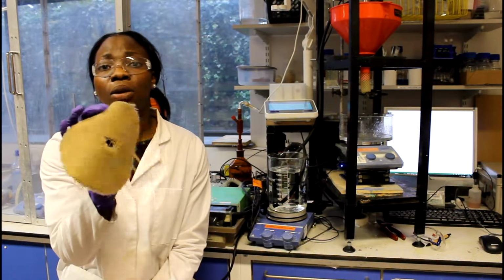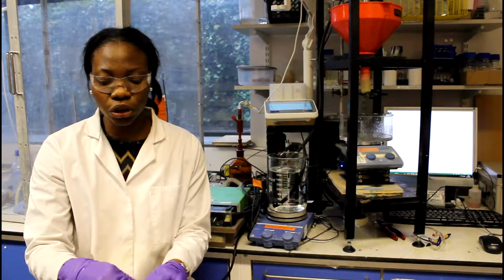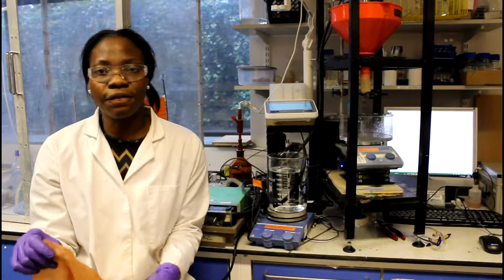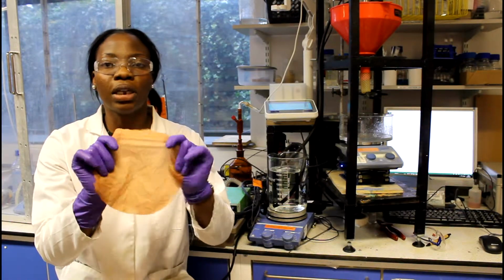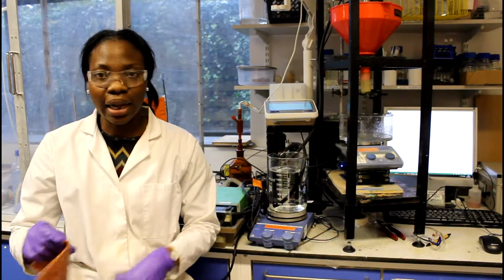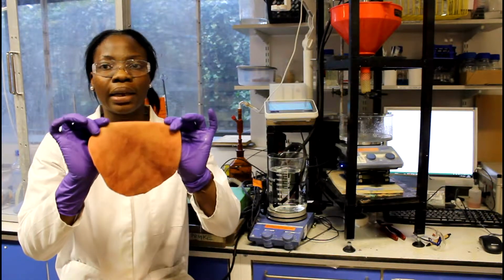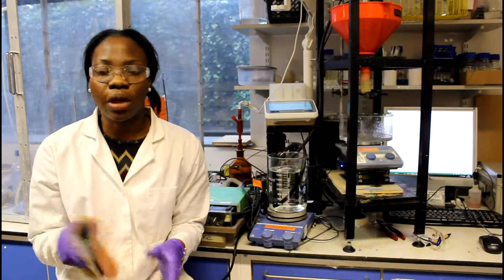The first type of nylon material that I'm using is a nylon carpet material, which looks like this. It's very thick, as you can see. The second type is a very thin nylon paper material, which looks like this. It's only 0.67 millimeters thick. And lastly, I'm using a nylon blanket material, which is this. All of these nylon cloths have enzyme immobilized on them.